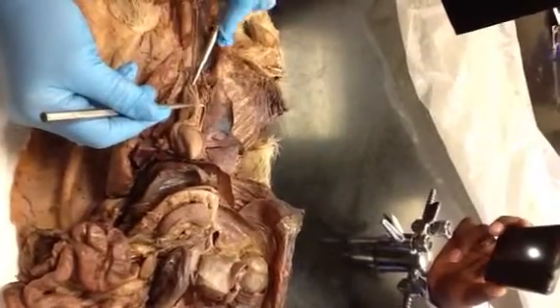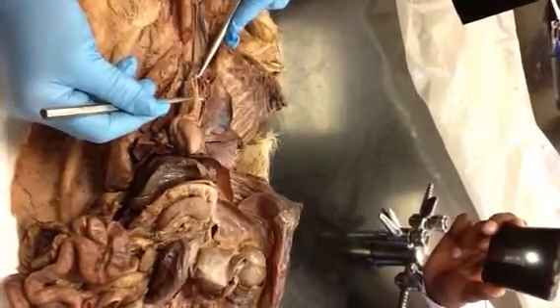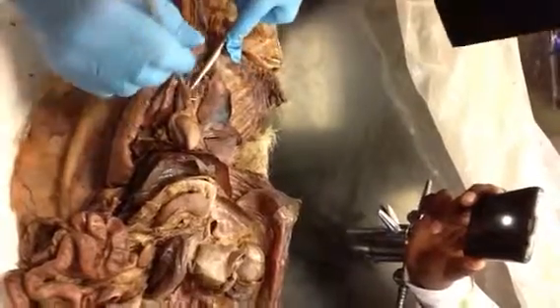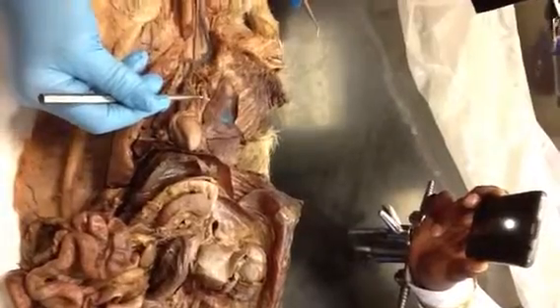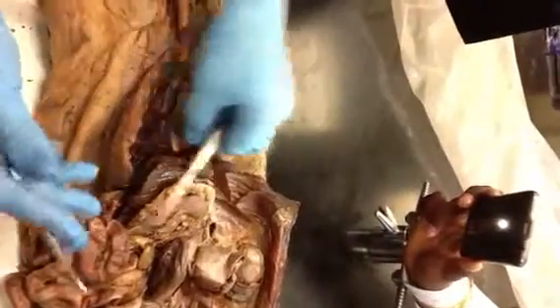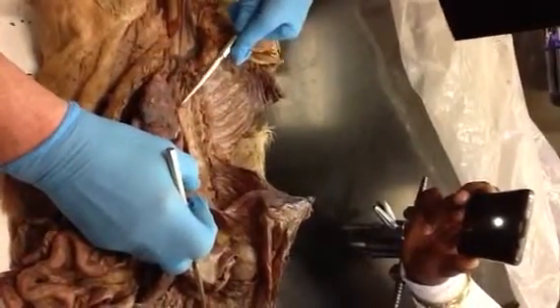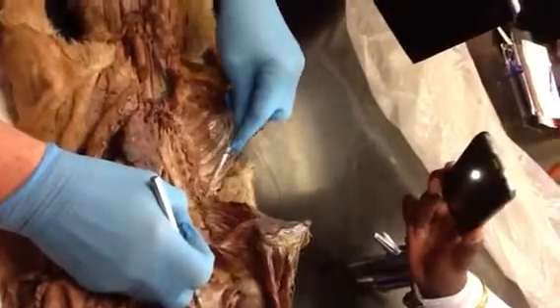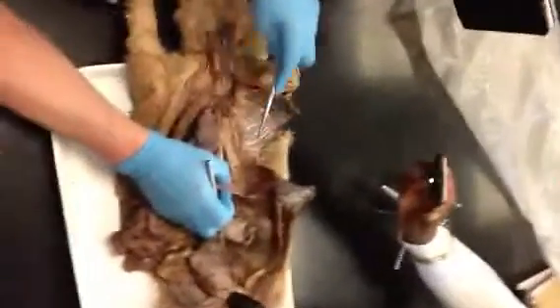So you're going to go subclavian, carotid, carotid, and our left subclavian comes off by itself. Again, this is all the aortic arch. Now I said to shift everything, and you'll see your aortic arch a little bit better. You can also see the intercostals, both the arteries and the veins. See them?